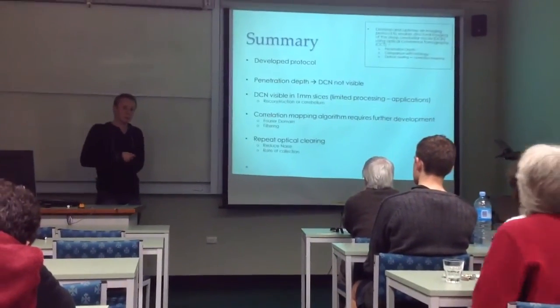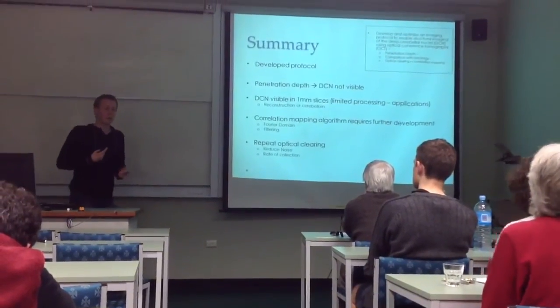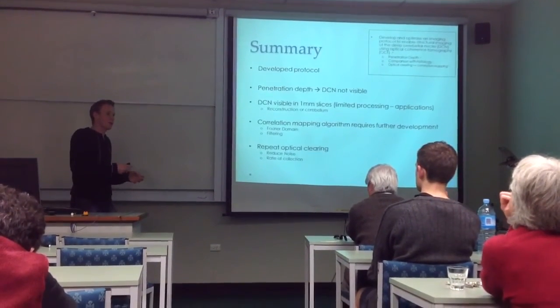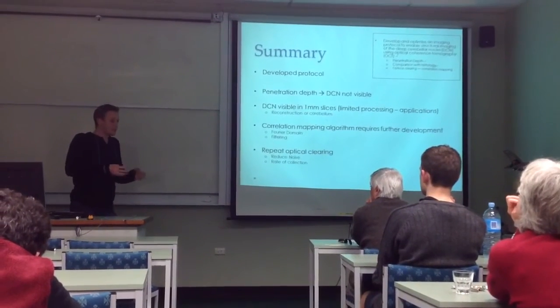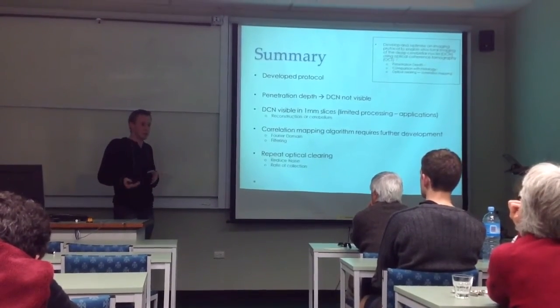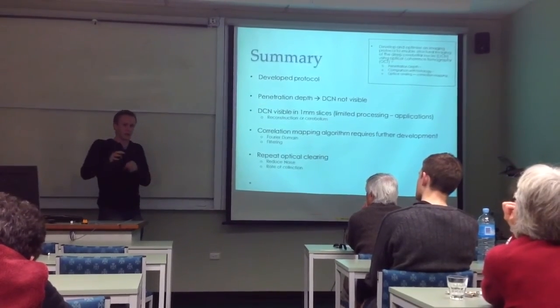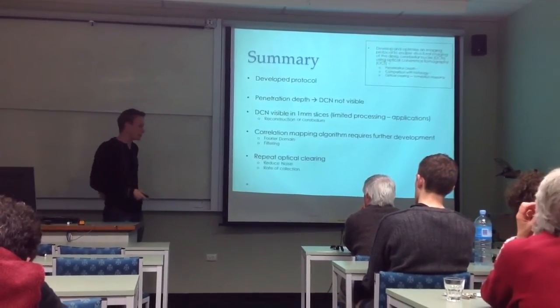And there's lots of clinical and physiological applications. We can now examine larger networks, hopefully get some sort of functional twist on whether, let's say, we could image whether the cells are active or not. That would tell us what cells are active, and hopefully in a time scale that you can see just different regions of the cerebellum lighting up, so you can actually see what's functionally going on.